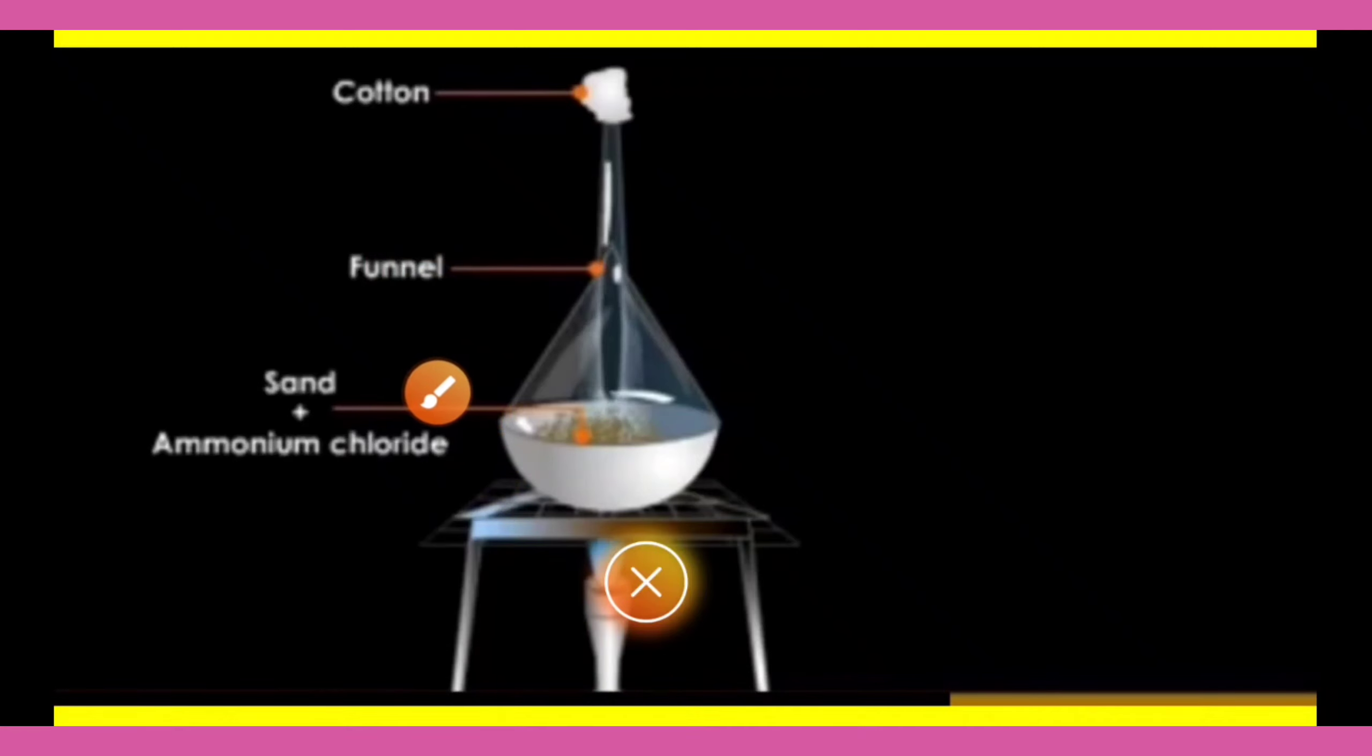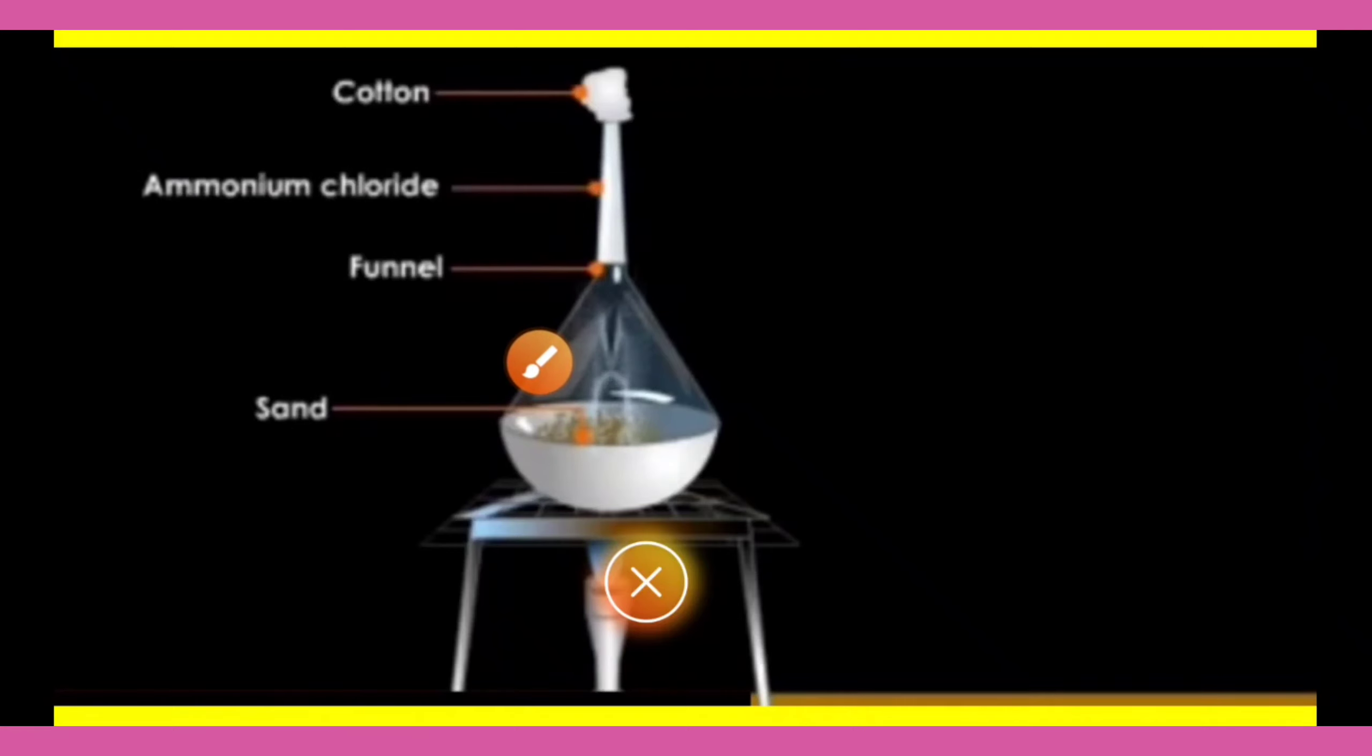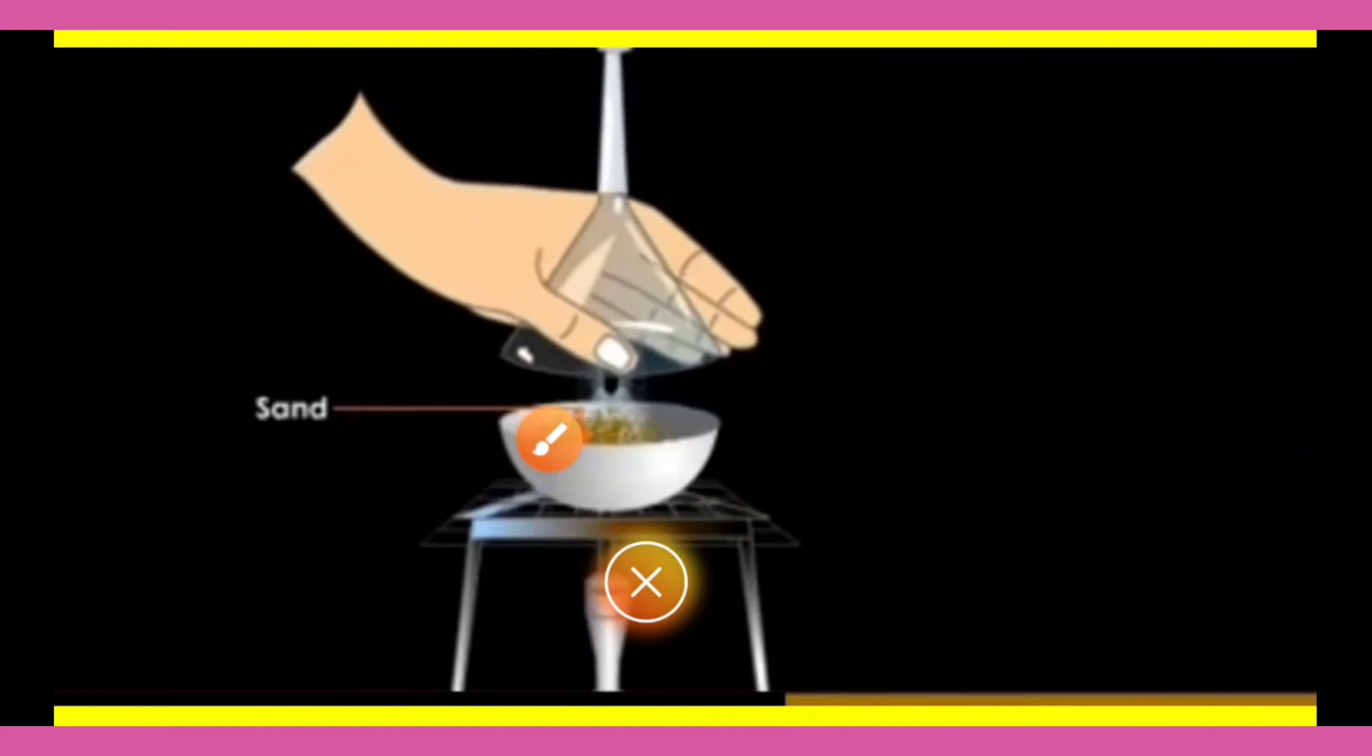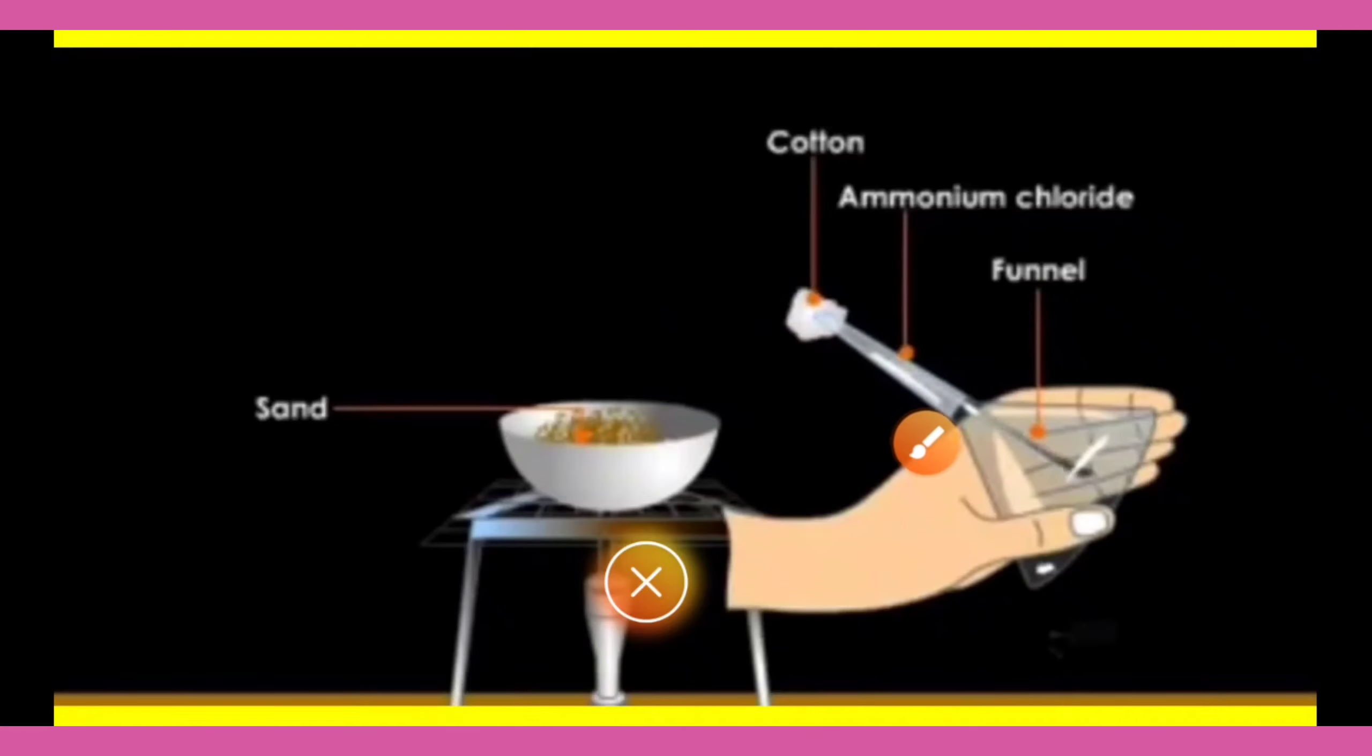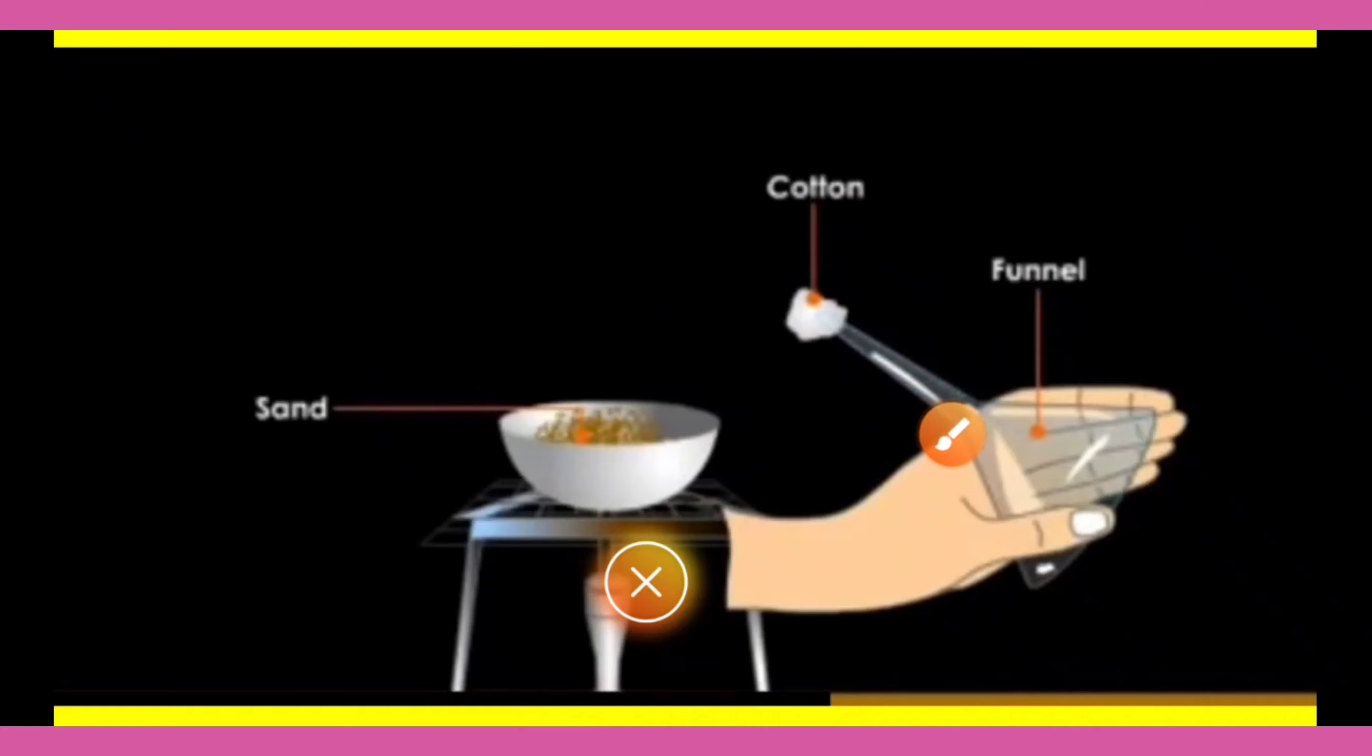The pure volatile substance called ammonium chloride changes into vapors and condenses on the walls of the funnel. The non-volatile impurities remain in the china dish. Now, remove the funnel from the china dish and scrape the ammonium chloride separately.